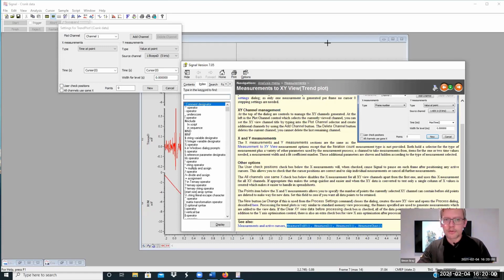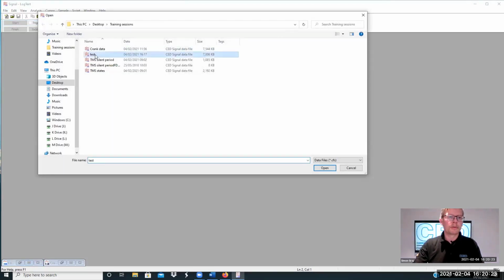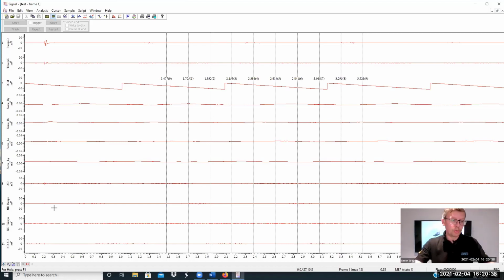Now, as I'm here and as I'm talking about that, perhaps I could do something like create a small script view. Many of you, I'm sure, haven't written a script or perhaps even programmed before. So to get going, I would advise simply script, turn recording on, file, open, test data here, perhaps make it as large as you like on the screen, and then I'm going to put all of the cursors on the screen. I'm doing that with Control 0, 1, 2, 3, 4, 5, 6, 7, 8, 9. You could also add horizontal cursors, and I'll add just one here.